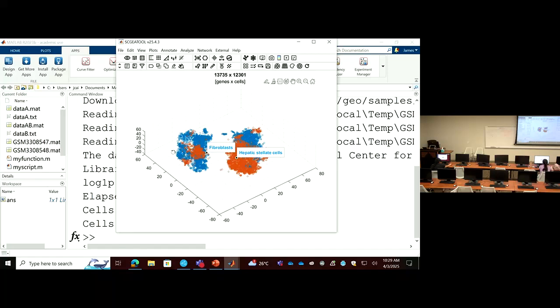So you have to decide which cell type you want to compare. Then click on one of the cell types, maybe the blue one. Neurons? What's the blue one? Yeah, you have to select which one you compare.